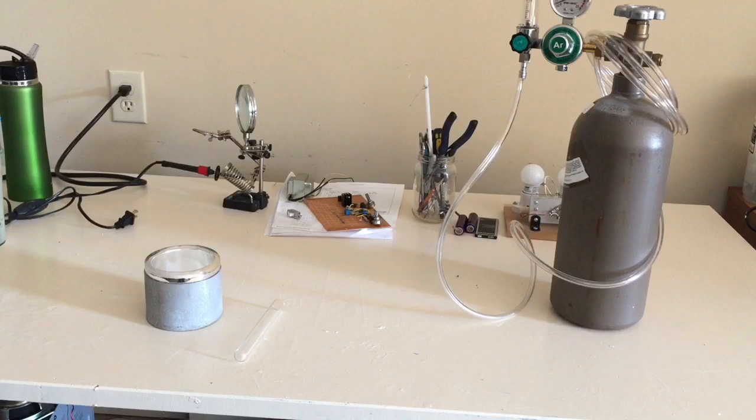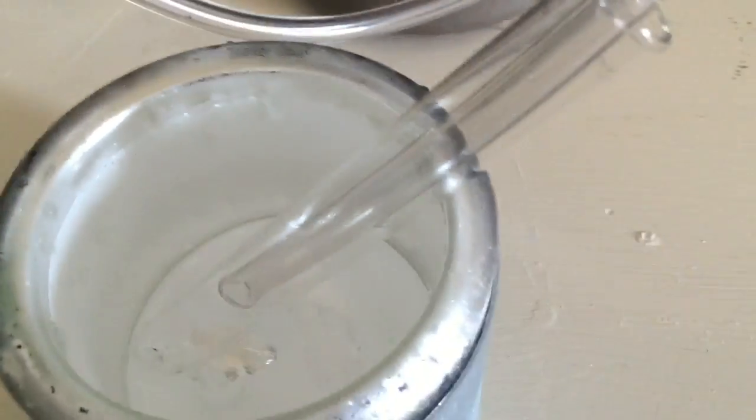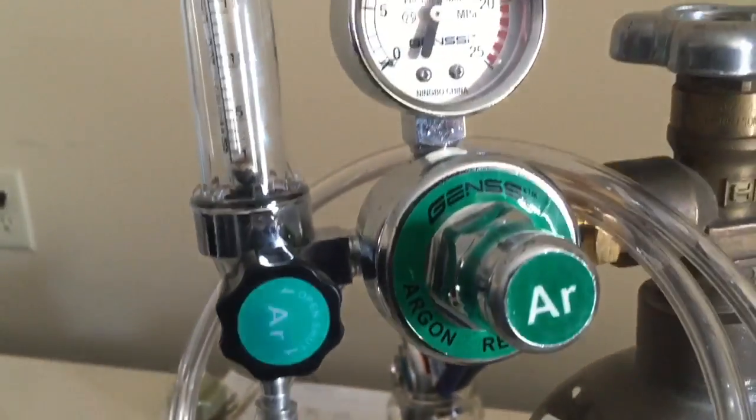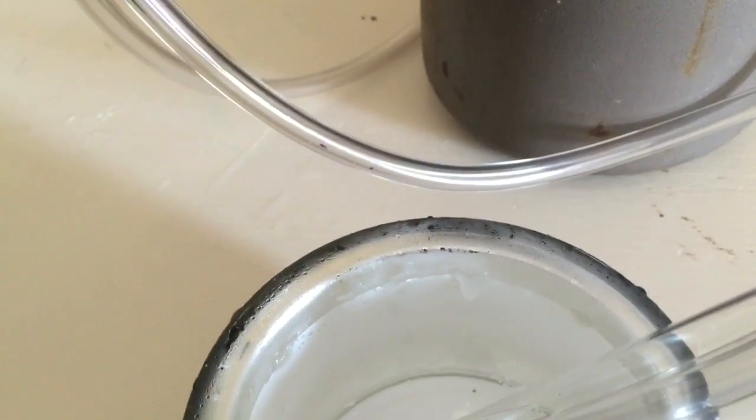Hey YouTubers and welcome back. In this video we're going to try and make argon ice. That cylinder on the right is argon and we're going to blow it into that test tube on the table, cool that tube in liquid nitrogen which is in the dewar vessel right next to it, and see if we can get it to freeze and become crystalline. So let's get going.